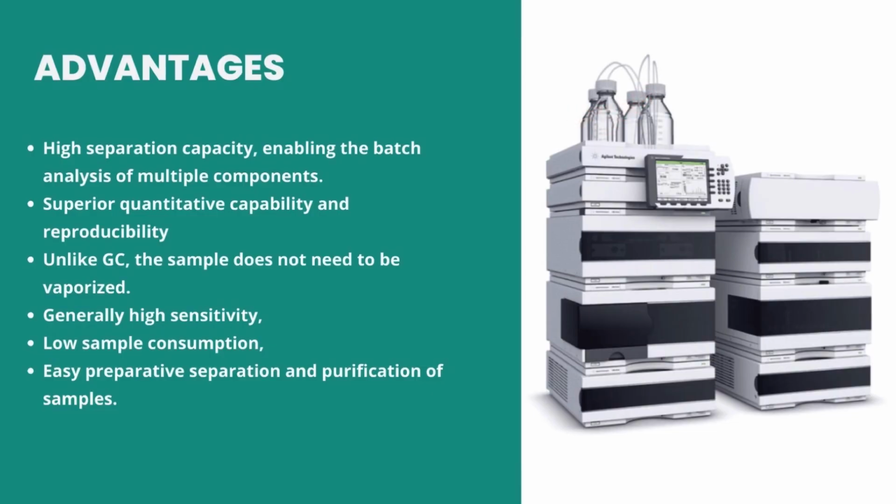And if we want a 50-50 ratio, 2 bottles will be filled with water and 2 bottles will be filled with methanol. So in this way we can contain 2 or more solvents, and then by using a computerized system we can mix these solvents, either with constant composition or with increasing or decreasing composition, and feed them so they pass through the columns of the chromatography. That is why we use several bottles or different solvent reservoirs to send them for the analysis.